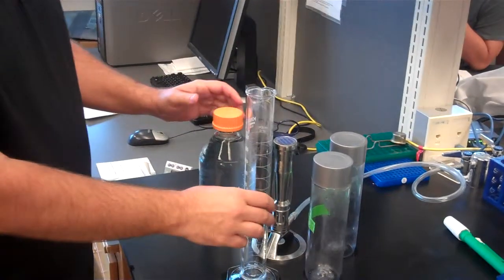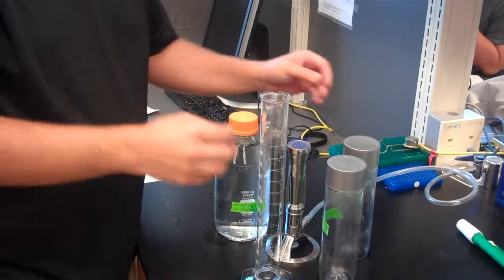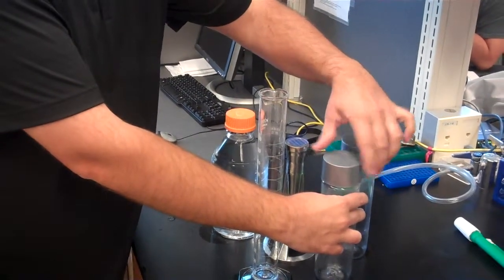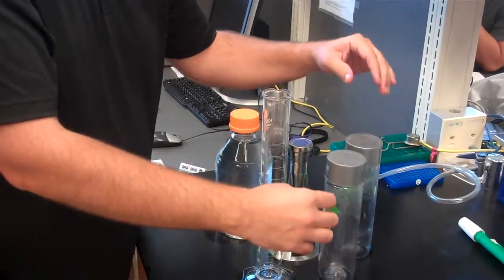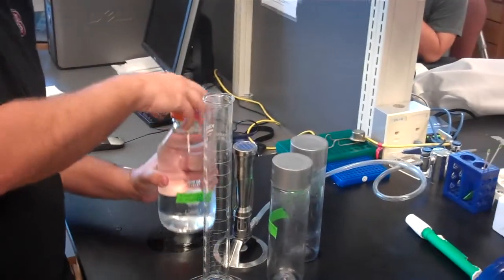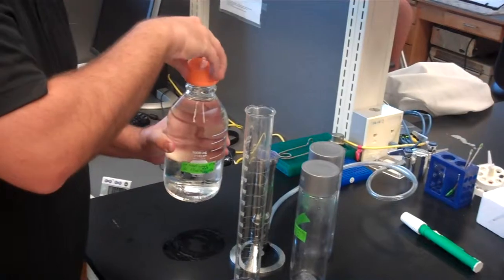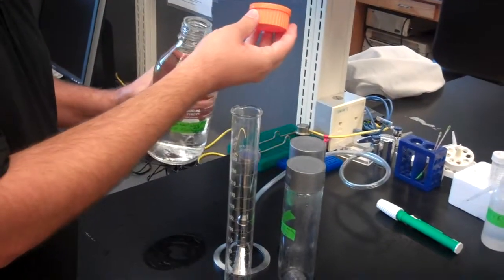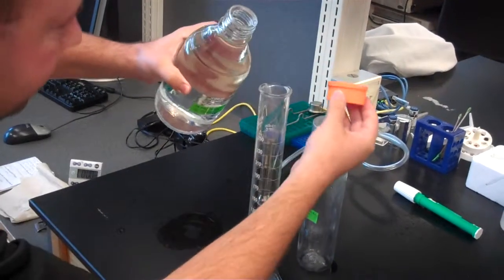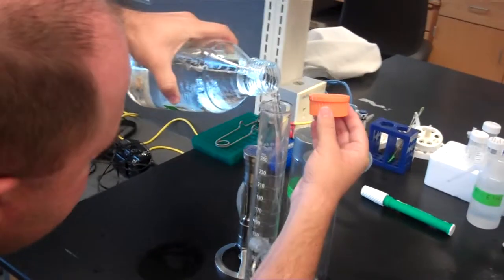Okay. Now, what I'm going to do is loosen the top on this, and I'm going to loosen the top on my first one that I'm going to be pouring it into, but not taking the top off all the way. I'm going to take the media jar, keeping this in the sterile field. I'm going to hold the cap with one hand. Notice that I'm going to keep my hands together so that both hands are still in the sterile field as well. And I'm going to pour this into 250 milliliters, which is how much I want to put into the water bottle.